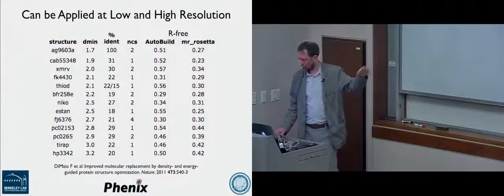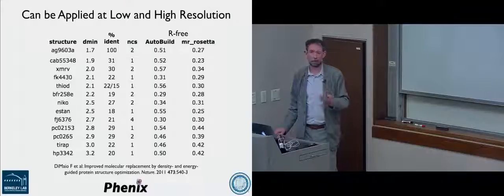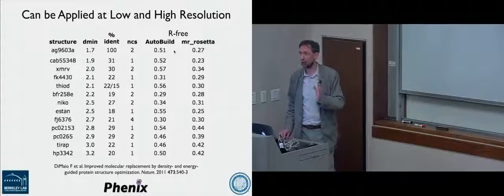And this just shows you that you can apply this over a range of resolutions. Some are going to be better than others. Of course, at lower resolution you have less information, so it's not going to work as well potentially, but it shows you that generally you get improvements across all resolution ranges. The better the resolution, the more this will improve things, of course. It's just a general thing.